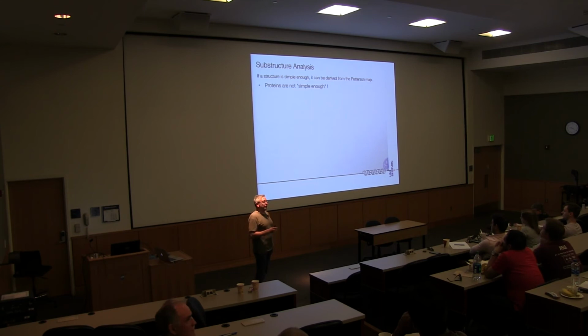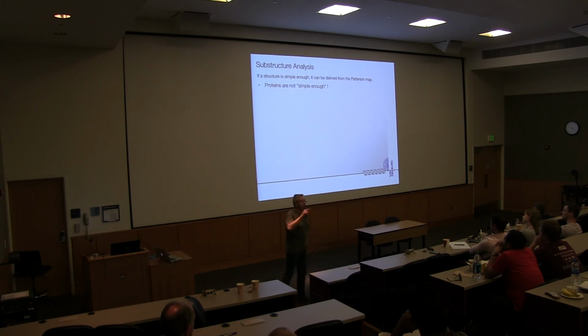But if you made the right choice at some point of your life to go into bioinorganic chemistry, then your proteins have this very nice feature of having a very limited set of atoms that are unique to this protein, and you might only have 3, 4, 5, or 20 of them, but not 2,000 or 20,000, and that's, for example, the metal sites. So if you can identify a subpopulation of atoms in your structure and determine their position, for example, from a Patterson map, then you can use that to solve your entire structure.